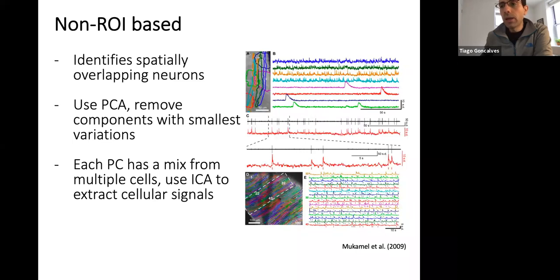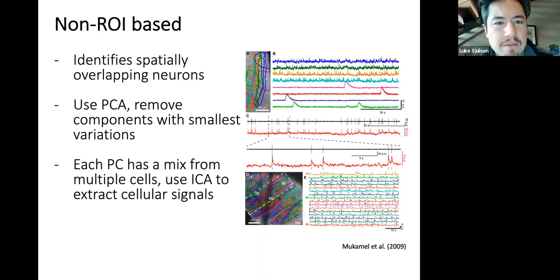there may be situations when you want to look at counter-correlated activity, when you're actually interested in the silence. But again, for you to be able to say that, you would need to positively verify with some sort of event that this is actually a cell, and a cell that is firing, right? So, could I make a comment on that? Yeah.